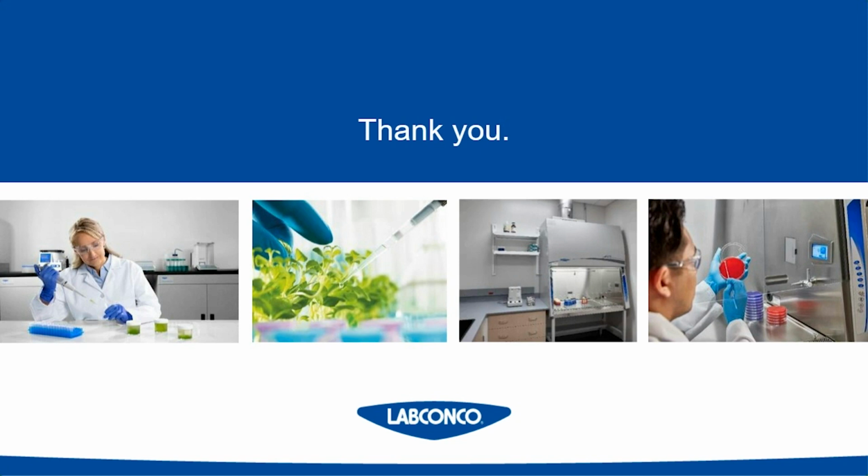Now, depending on how many air changes per hour your HVAC system has in that room, the B2 cabinet is going to exhaust a large volume of air. It might be the case that your HVAC system cannot keep up with those cabinets. In that case, a C1 would be a good recommendation because its exhaust volumes are a lot lower and it still provides you with that 100% exhaust in that chemical work area.